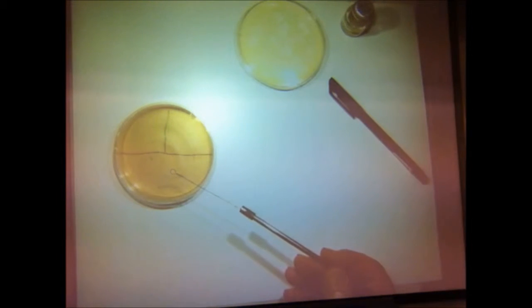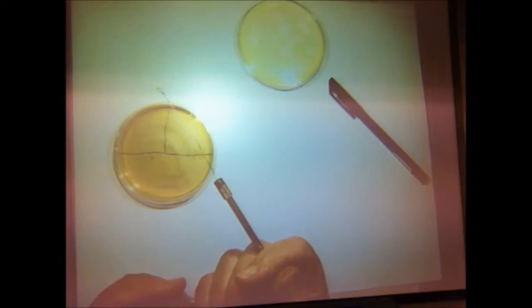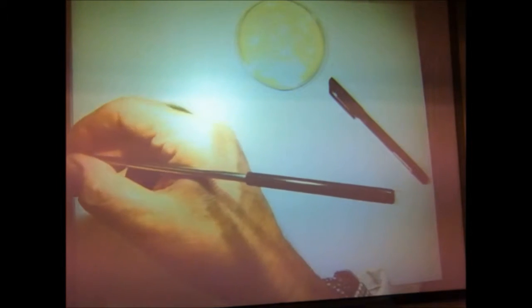So here we go, a little bit of poetic license here. I can't use a Bunsen burner by this visualizer that I'm doing the practical on, so you'll have to pretend that I've got a Bunsen burner here, which is a light. But what we'll be doing is, again, the famous two-hand trick. So I'm going to undo the culture, like so. I'm going to pass it through the flame on the slant. I'm going to reach in with my sterile wire loop and take a loop full of culture out.